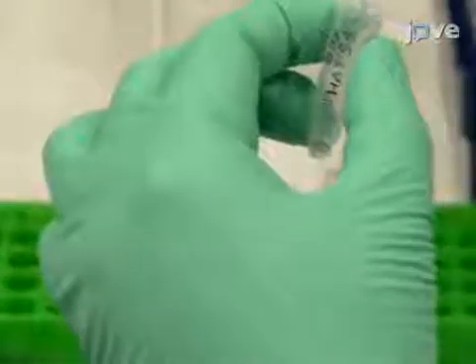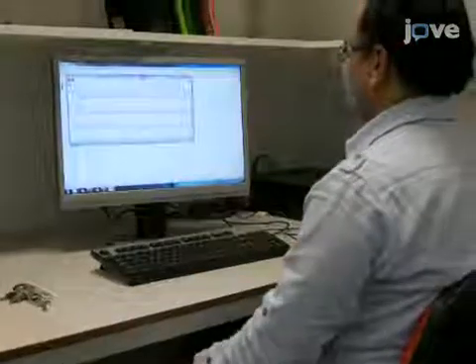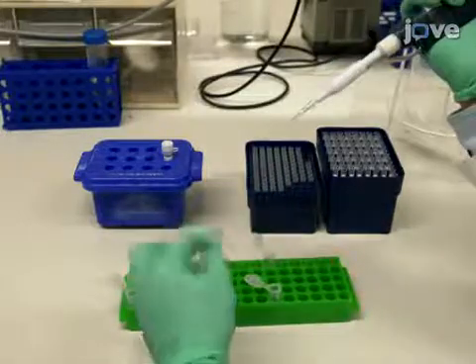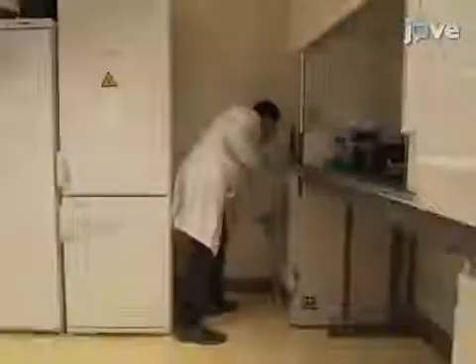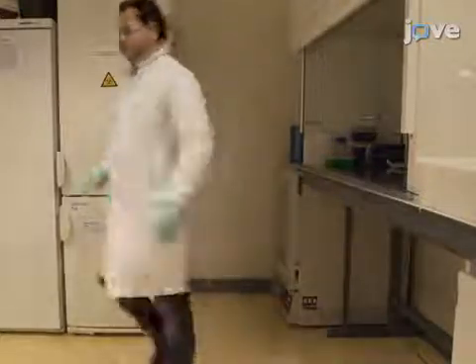First, sequence them. Their electropherograms should be clean and correspond to a single immunoglobulin sequence. Following the text protocol, clone the purified PCR product into a microgram of plasmid DNA. Be sure to ligate overnight at 16 degrees Celsius using T4 DNA ligase.